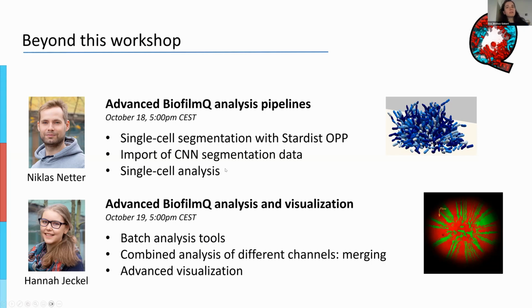And she's also going to talk about merging, where you can, for example, analyze an image like this one on the right. If you have several channels and you want to do combined analysis of these channels, you can merge them. And she's also going to talk about some of the more advanced features of the visualization that I'm not going to be able to cover today.